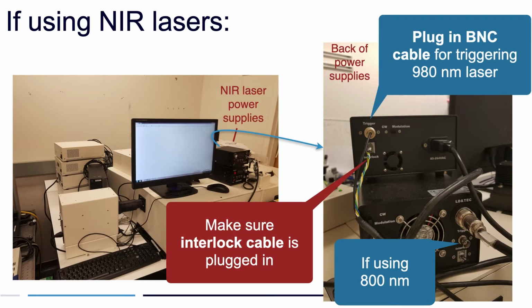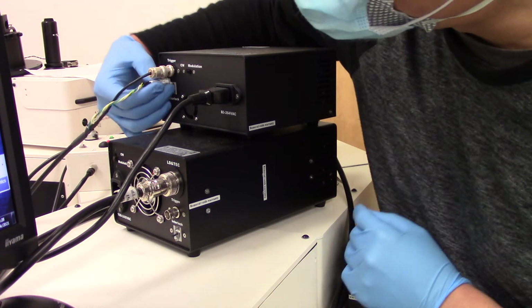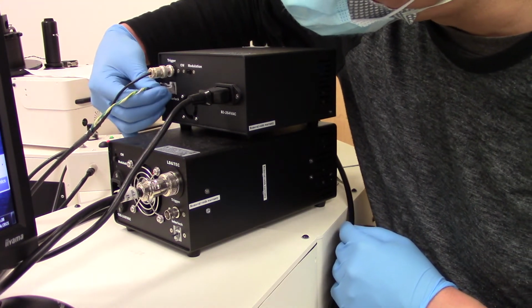You also want to make sure that the interlock cable is plugged in the correct laser. If the interlock is broken, then the laser will not turn on.